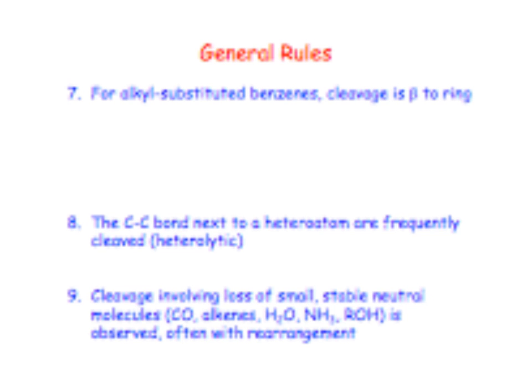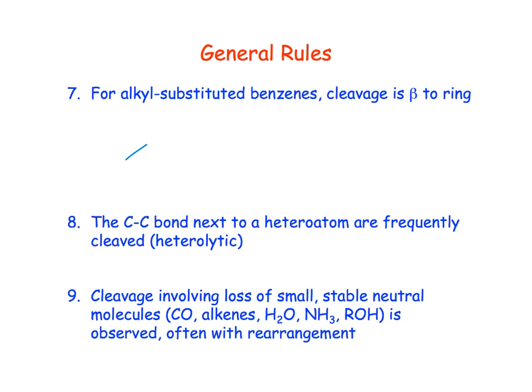More things. Okay. When we have substituents on benzene rings, the way we can show the cleavage is that first we'd ionize, similar to what we did on the other one, but this time I'm going to draw the radical at the position of the attachment.